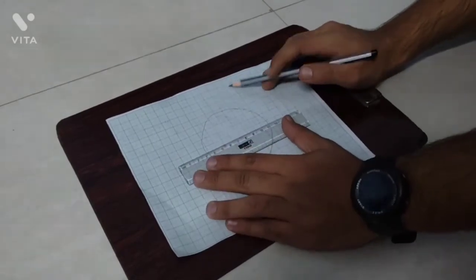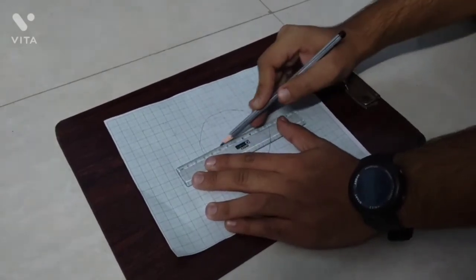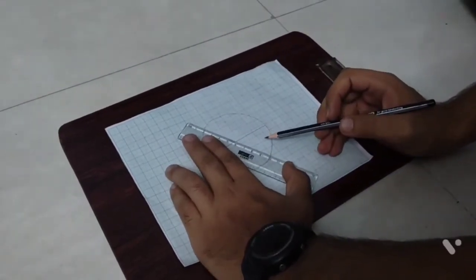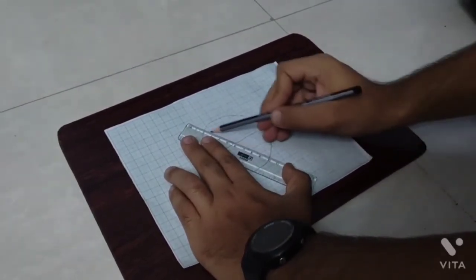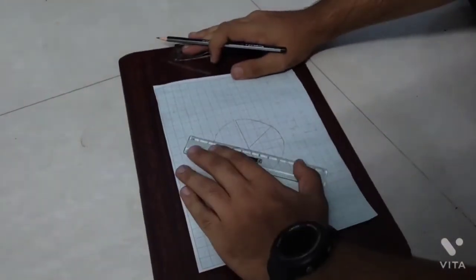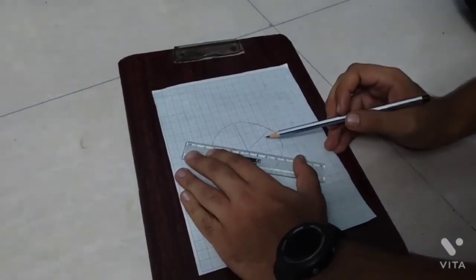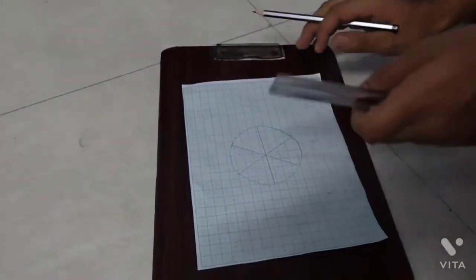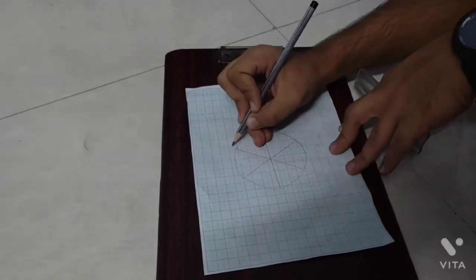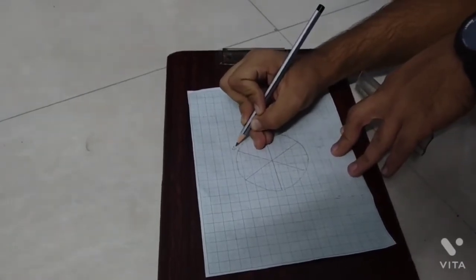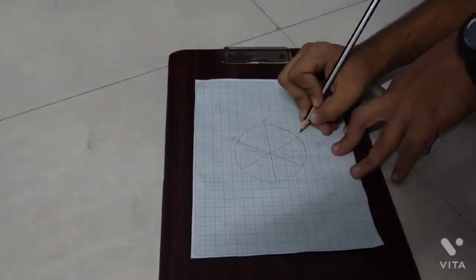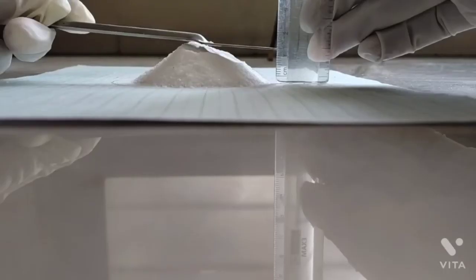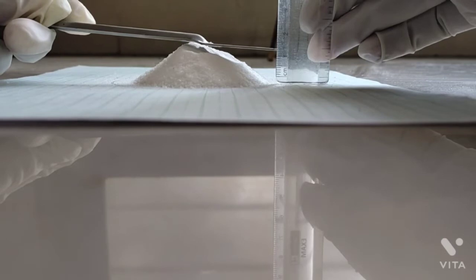After that draw 3 diameters of that circle and mark them as D1, D2 and D3. Then measure the height of the cone which is formed by the powder.